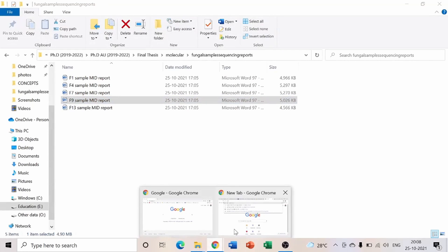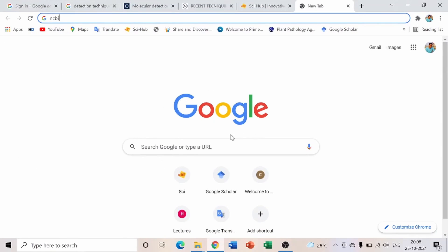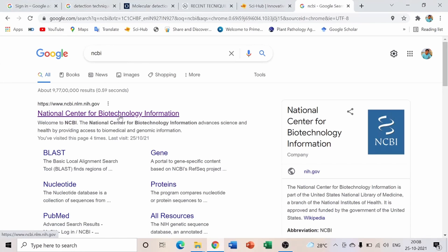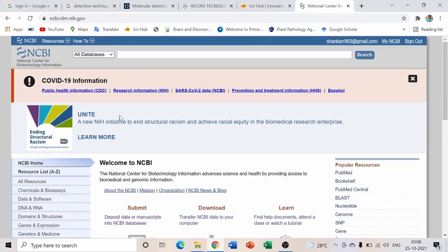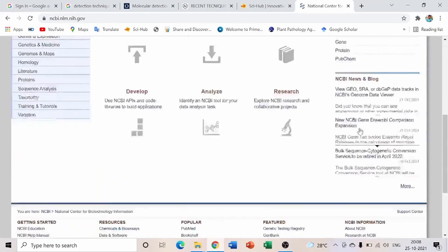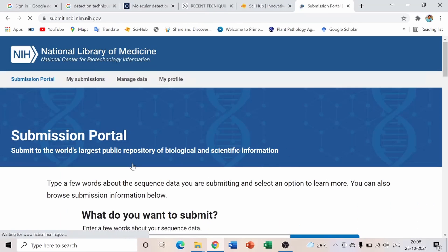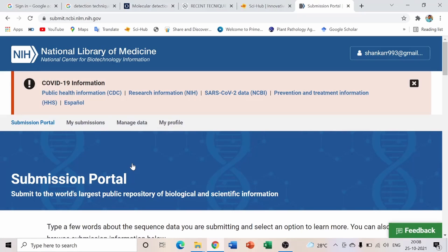Now I'll show how to deposit sequences in NCBI. Go to Google and type 'NCBI.' The NCBI — National Center for Biotechnology Information — page will open. If you already have an account, your email ID will appear on the right side. If not, you can link it to Google to create a new account.